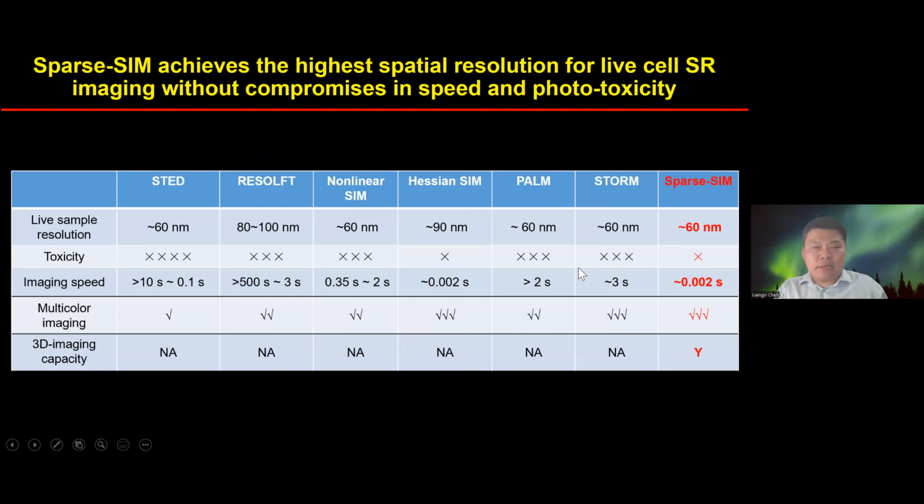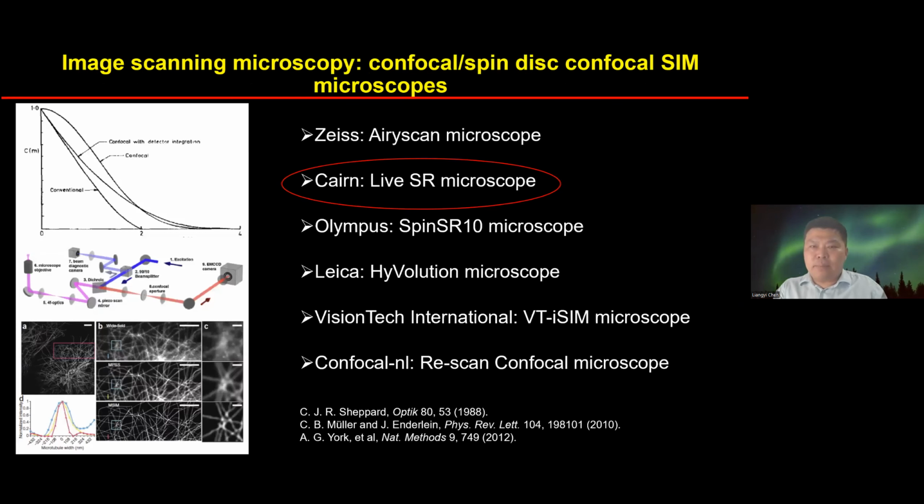So a short summary here is, now with a purely computational, deterministic algorithm, we can further improve our resolution from 90 nanometers to about 60 nanometers, or even better than 60 nanometers, depending on the signal-to-noise ratio, okay? But can this method be applied to other fluorescence microscopes? We think probably yes, because spatial temporal continuity and sparsity should be general prior knowledge for all kinds of fluorescence microscopes, not just for them.